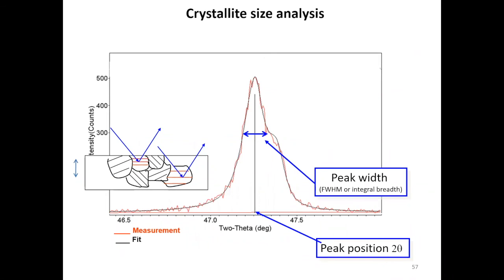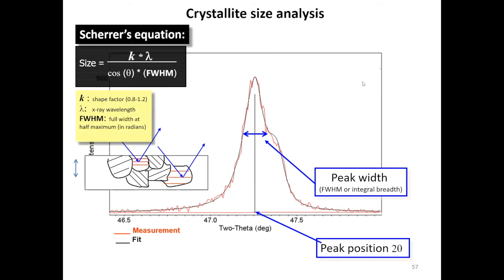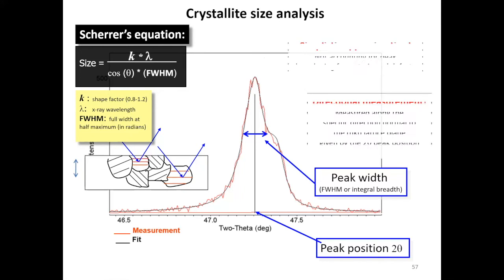Now, again, as in X-ray anywhere, things that seem too simple have gross approximations there. Number one, you are not accounting for other effects on this broadening, like the strain, defects, dislocations that could play a role in that. It's a very simplistic approximation. Second, remember that when we measure those peaks, this is just in one direction, the direction of the surface normal. You are measuring the grain size in only that direction. And if you have an inhomogeneous distribution of size, you are not picking up that information.